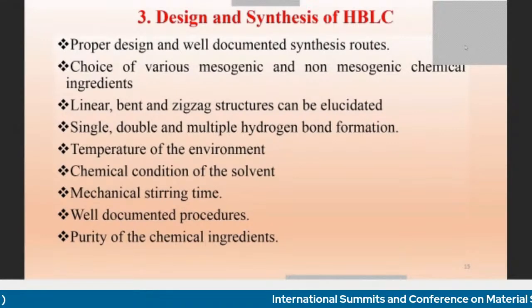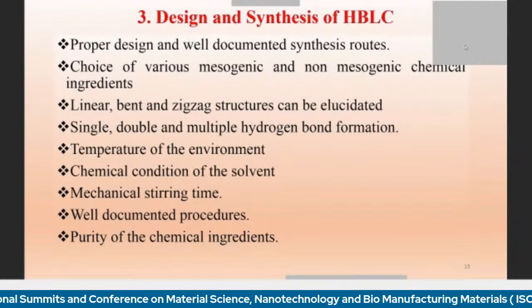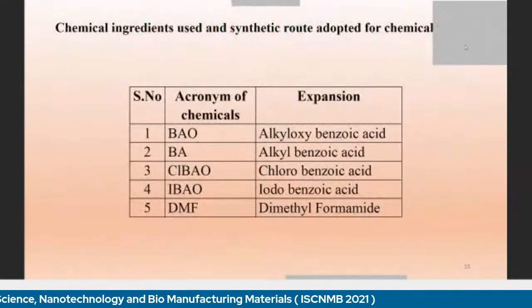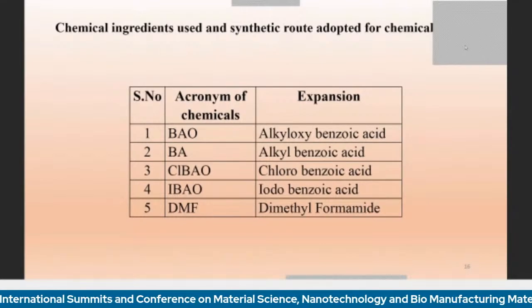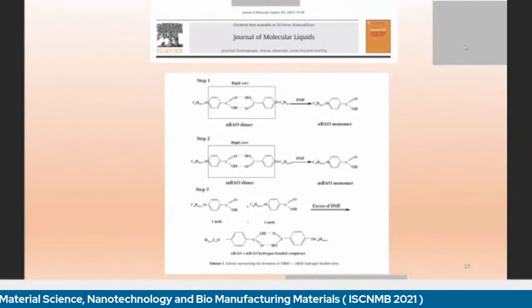We use DMF, that is dimethyl formamide, and mechanical stirring time should be analyzed. And finally, the purity of the chemical ingredients also plays a vital role. So the purity of the product depends upon the purity of the ingredients. So in our discussion, we have taken benzoic acids, chlorobenzoic acids, and iodobenzoic acids, which form hydrogen bonded liquid crystals with p-n-alkyloxy benzoic acids. The solvent we used here is DMF, that is dimethyl formamide. And this is the well-rooted synthetic procedure that has been followed to design and synthesize liquid crystals.